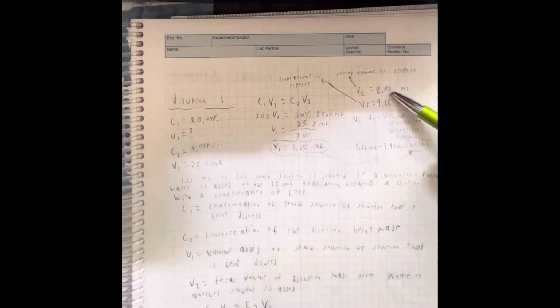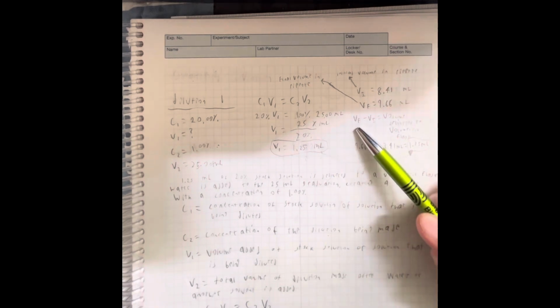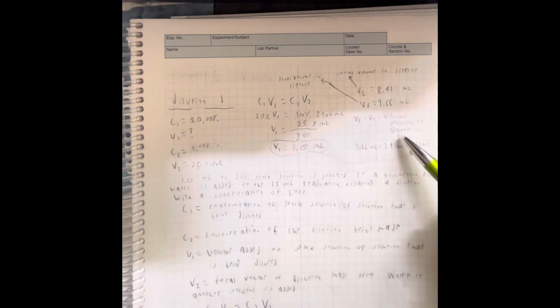So we got a pipette and drew up to an initial volume of 8.41 milliliters, and then released the solution into the 25 milliliter volumetric flask until it was 9.66 milliliters. Because the volume final minus the volume initial is the volume delivered, that means we delivered 1.25 milliliters of stock solution to the volumetric flask.